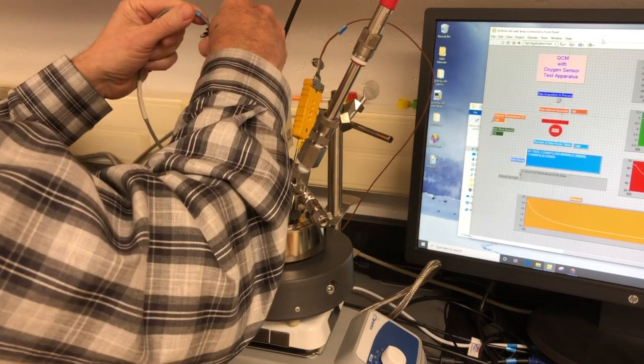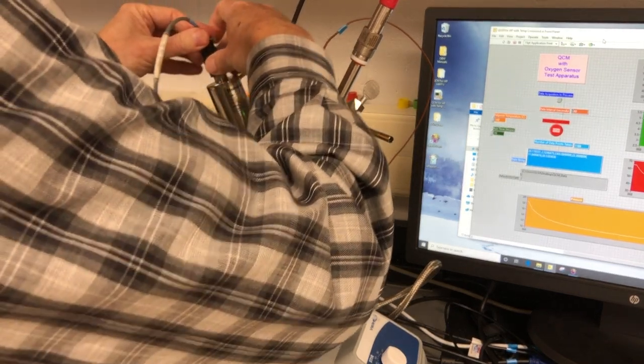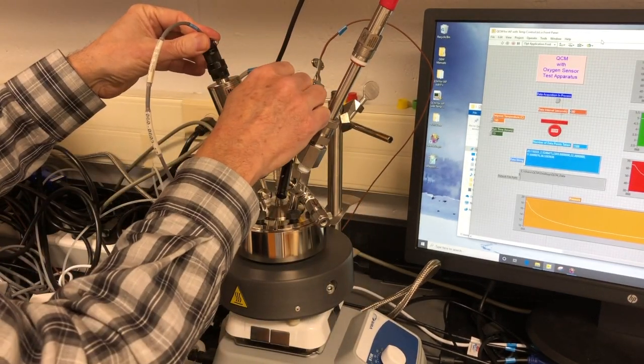Now fit the pressure sensor connector. This will connect readily once the pins are aligned properly. Rotate to tighten.